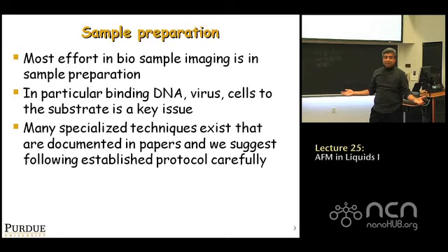And the physics behind each one is different, and the advantages and disadvantages are very different. The chemistry is different. And the substrate, whether you want to do it on glass versus mica versus graphite, very different objects, right? To understand what method you choose to immobilize a sample.